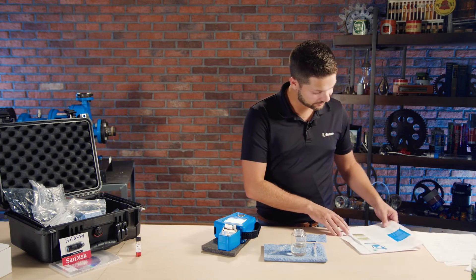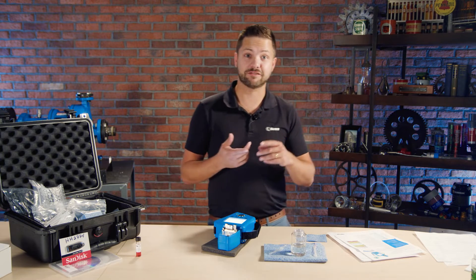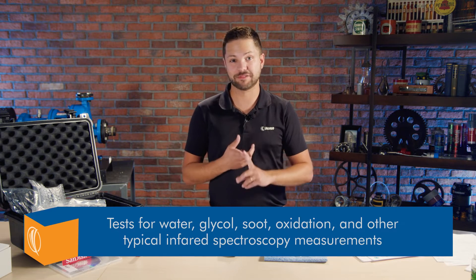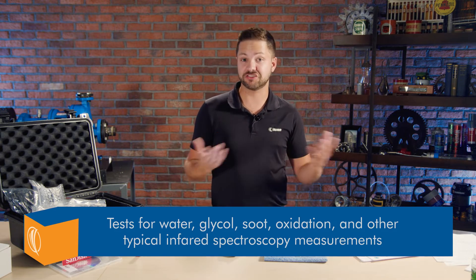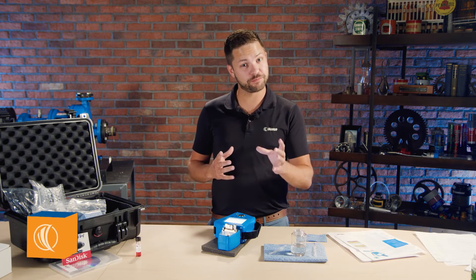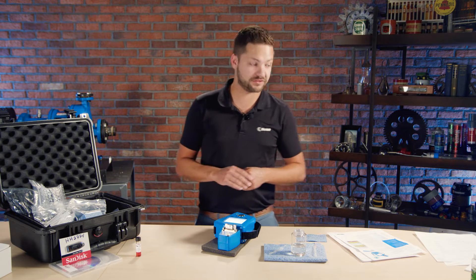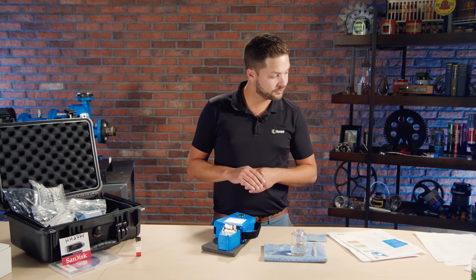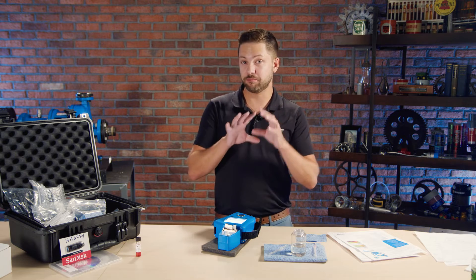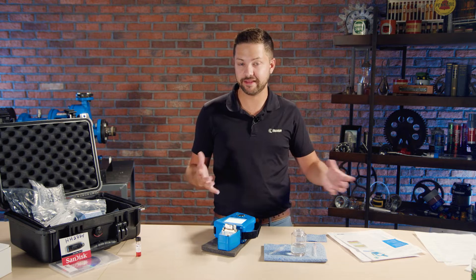As it's going, I'll talk about a couple of things. You'll see in the literature they provide that it tests for all the typical infrared spectroscopy measurements: contamination of water or glycol, and if it's an engine, soot as well. It also measures oxidation, nitration, and sulfation — oxidation in particular being important for determining the overall condition of the lubricant. It also looks for additive depletion, like anti-wear additives depleting over time. Infrared is looking at the molecules, which is a little different than elemental spectroscopy, which looks at the elements themselves.